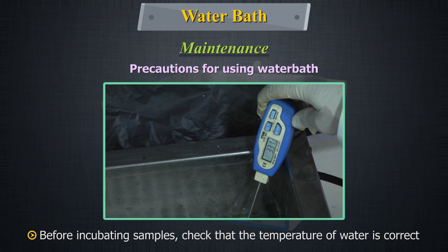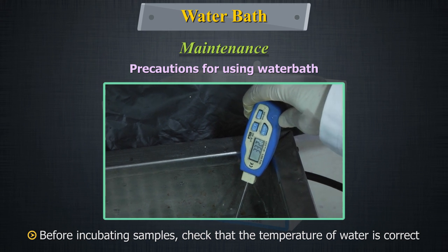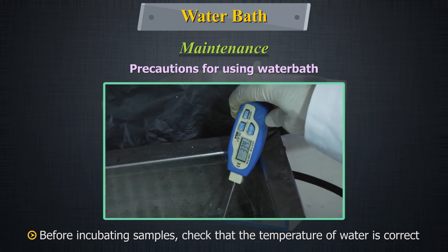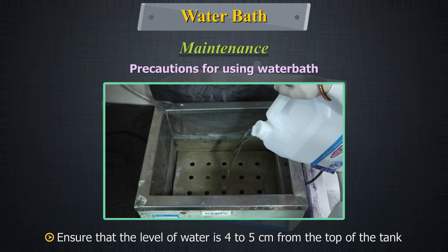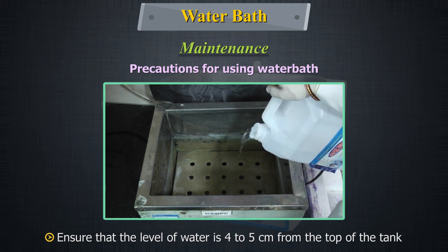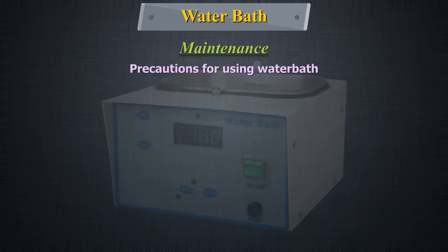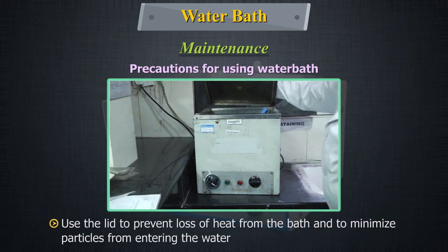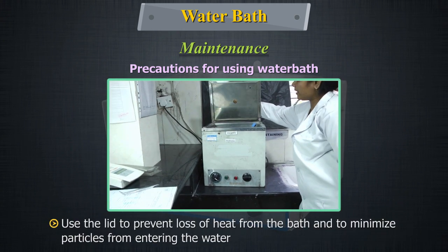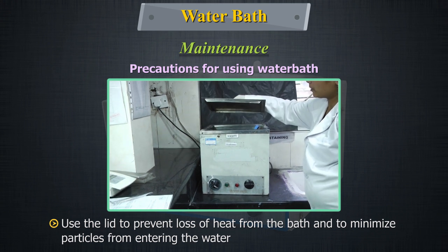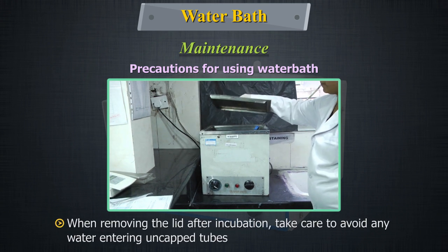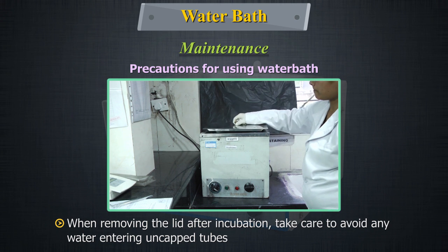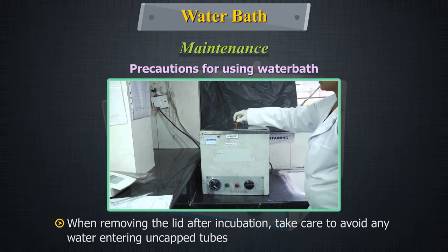Before incubating samples, check that the temperature of the water is correct. Ensure that the level of water is 4–5 cm from the top of the tank. Use the lid to prevent loss of heat from the bath and to minimize particles from entering the water. When removing the lid after incubation, take care to avoid any water entering the uncapped tubes.